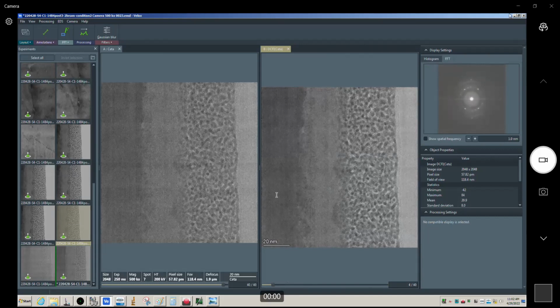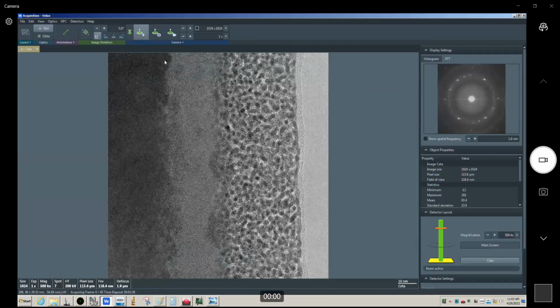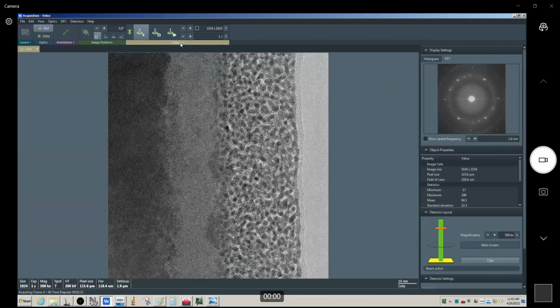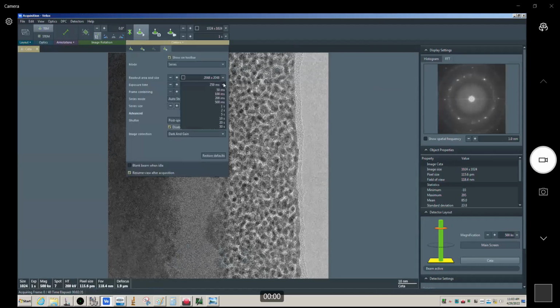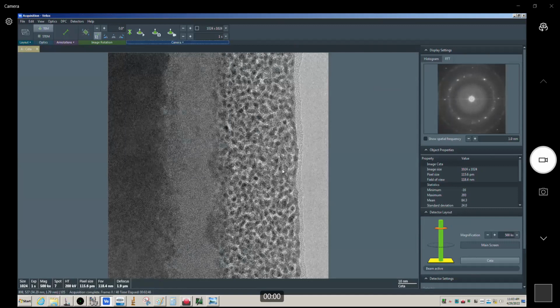I know this would work. I know this will work fine. If we put it back to the high current situation, so this is 1 second. If we try this a little bit more, but then if we go more than that, we're getting to the point where it kind of defeats the purpose. And this is an auto stop. All right, let me stop this. Put the screen back in.